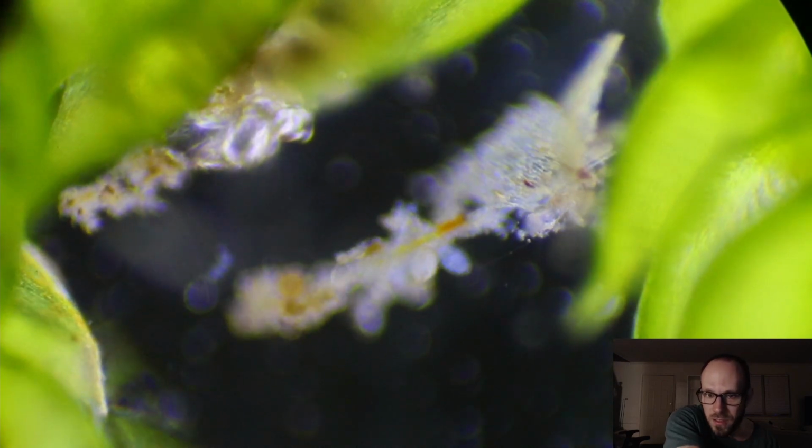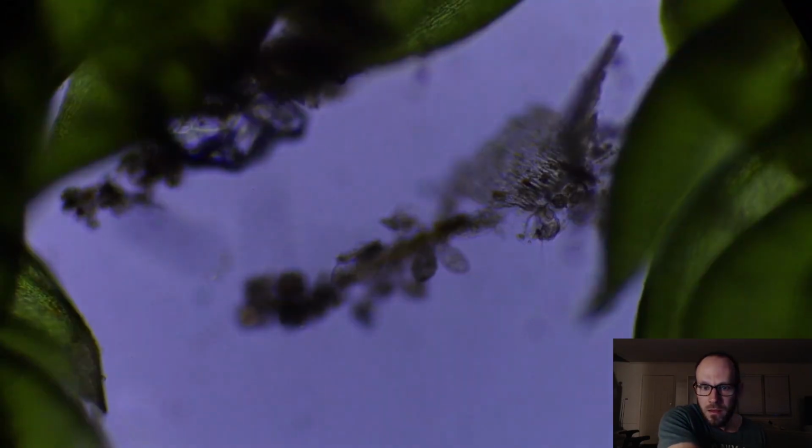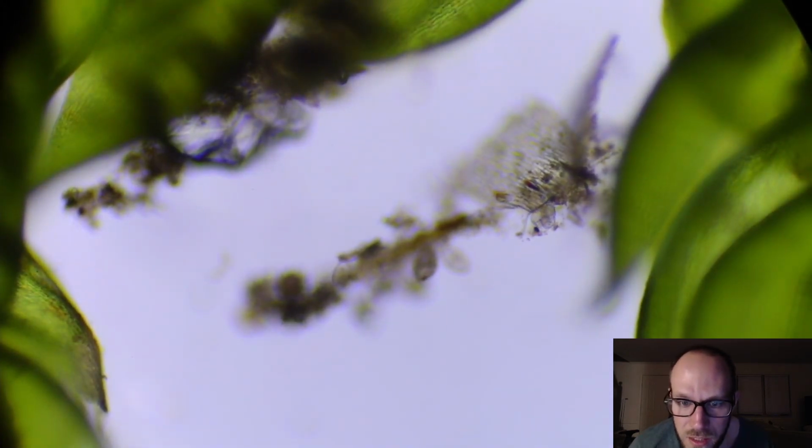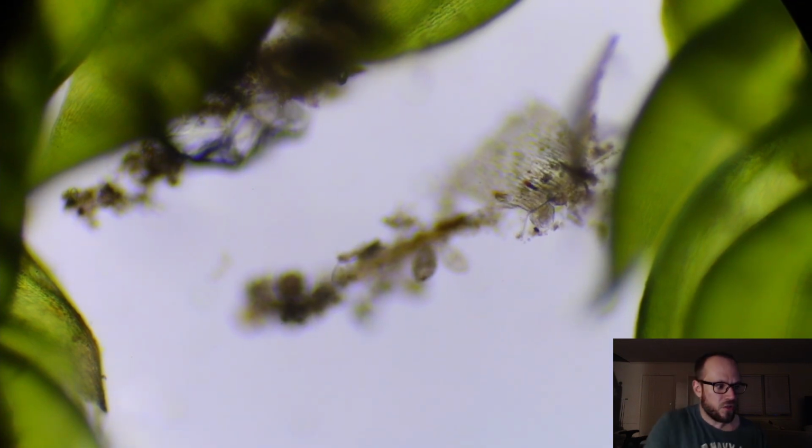I'm still kind of bummed out that I haven't found a tardigrade. I really don't think that's a tardigrade. Pretty sure that's a rotifer, but it's tough to tell, because I can't see any features. Actually, what we need to do is go to Brightfield again and turn up the light. It's not a tardigrade because we would see little legs moving, and it's on the other side of that leaf, but I'm pretty sure it's just inchworming along.